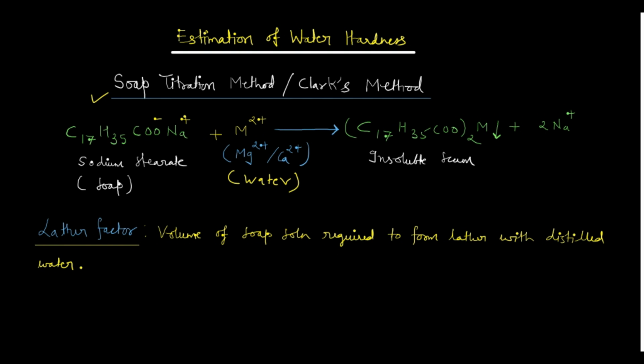So what is lather factor? Lather factor is the volume of the soap solution required to form the lather with distilled water. Here I have written distilled water, but you should remember this particular point, that distilled water should be of zero hardness, right? Generally we say that it is of zero hardness, but it is not really possible.